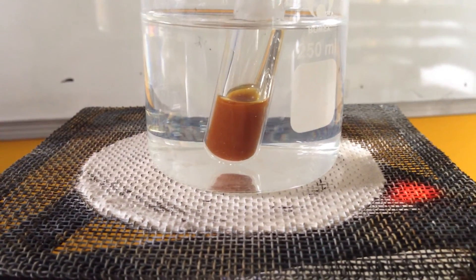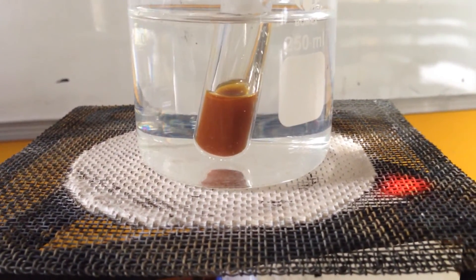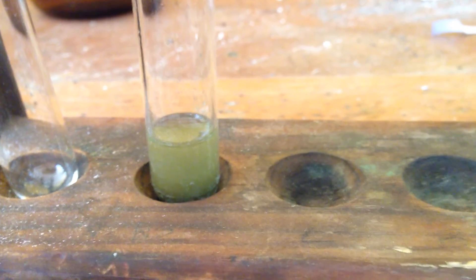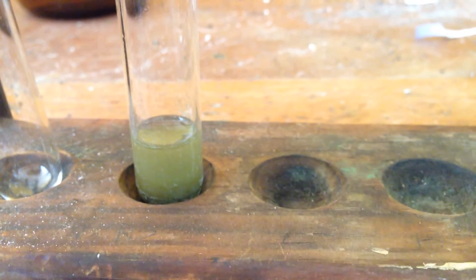Now we can start to see the red color coming through. So this is the result of our test with Fehling's solution.